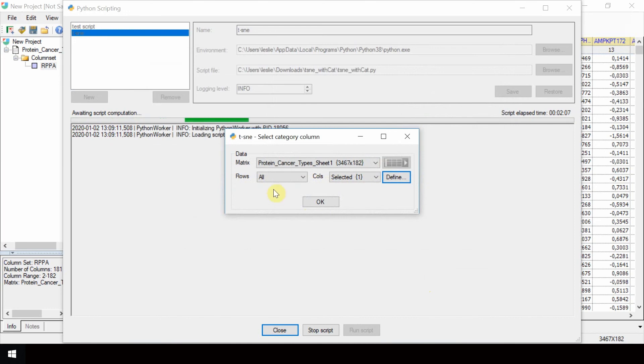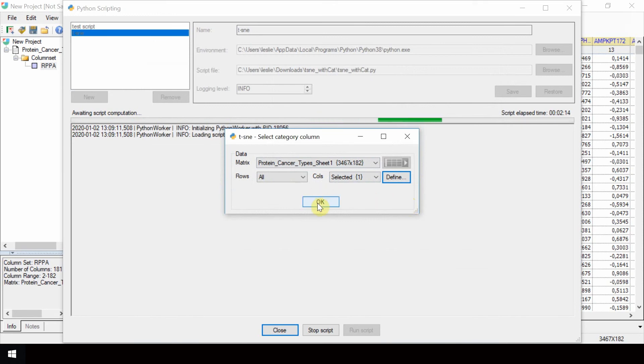Here we have the final setup for the select category column. Click OK.